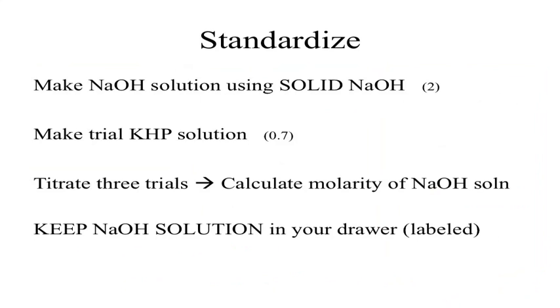So to standardize, you're going to need to make up a sodium hydroxide solution using solid sodium hydroxide. What's fun about solid sodium hydroxide?